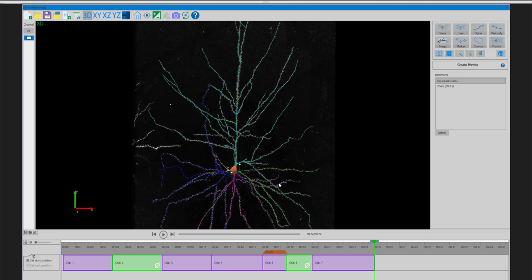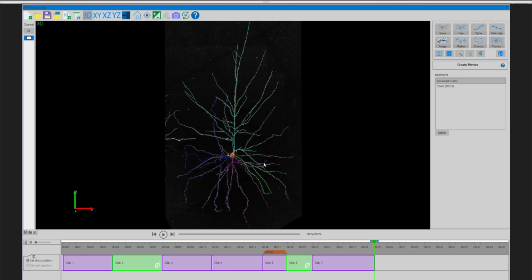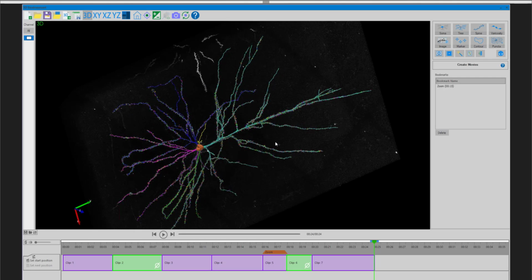The short answer there is no. That is something that we can look into. If there are movements that you're expecting or looking for or really desiring, that's something we can look into for sure. The easiest way to make that sort of attempt at a fly-through would be to start at the tip and move to the tail of this neuron specifically, while keeping the same zoom level and maybe panning out at the end. But that is a fantastic question, and that is definitely something that we can look into.